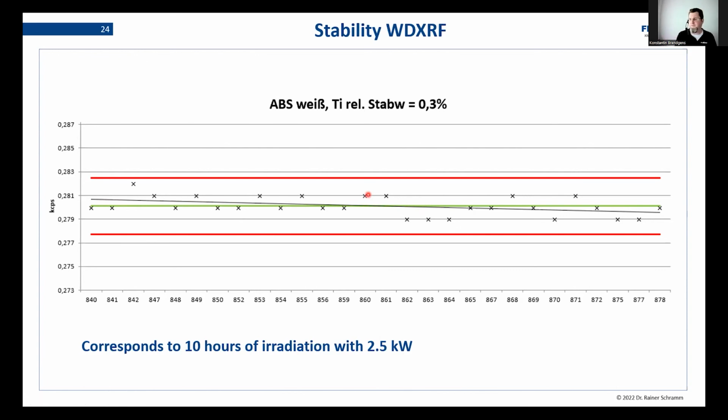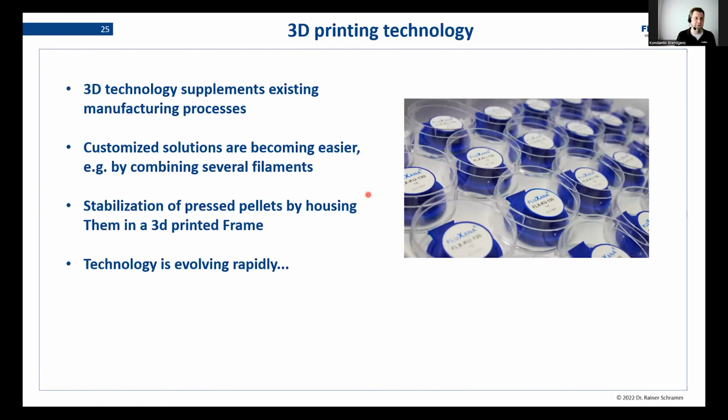We know similar effects from the thin films used in liquid analyzers, where the energy dispersive systems, due to the low power, don't affect the film, while the wavelength dispersive systems might. So that is something to keep in mind for future projects.